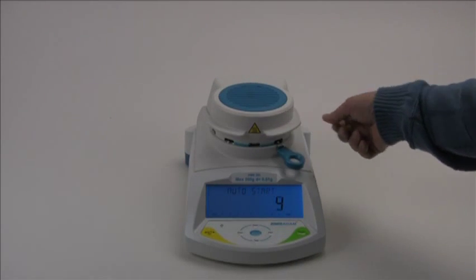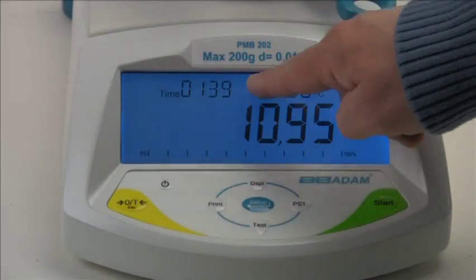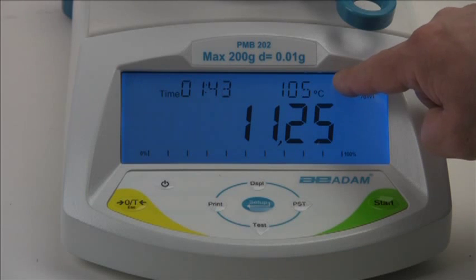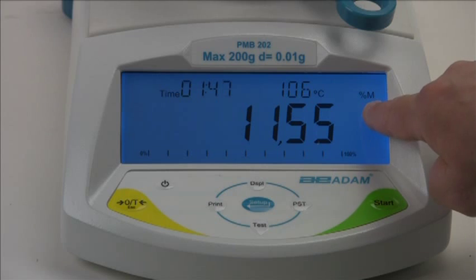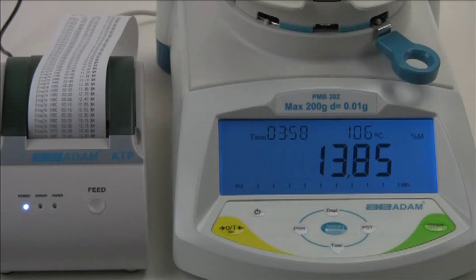The display shows complete test information including the elapsed time, the temperature inside the chamber, and in this example the percentage of moisture removed from the sample. If you have an Adam printer connected, you can output the test results for a printed record.